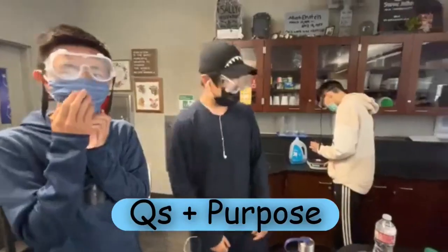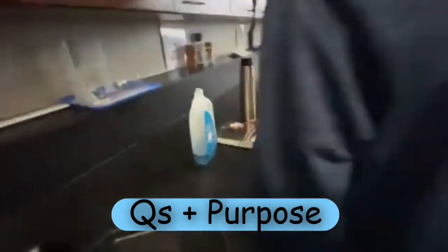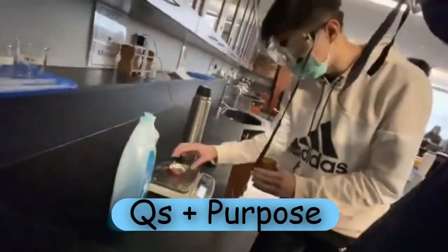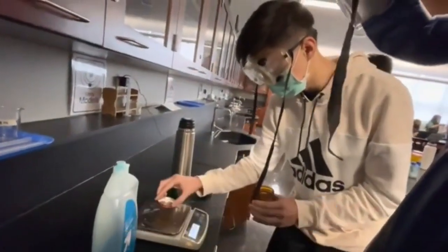This past week, we've been reading about enzymes and had learned from Chapter 8 of Campbell and Chapter 5 of Barron's AP Review that enzymes are important in regulating metabolic pathways, and without them, organisms wouldn't be able to grow, reproduce, organize, or maintain homeostasis. We began to wonder how certain factors affect the rate of enzymatic activity and if we could create an experiment to study this. The main purpose of this lab was specifically to test the effect of concentration of enzyme on enzymatic activity rate.